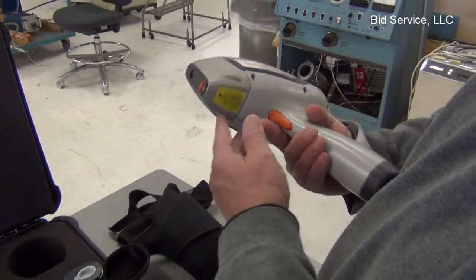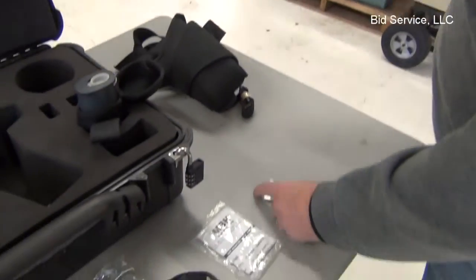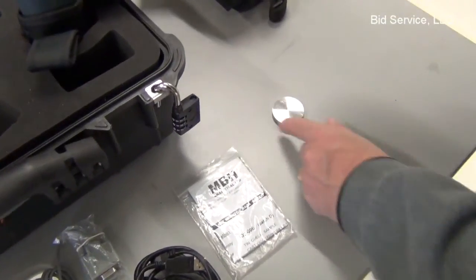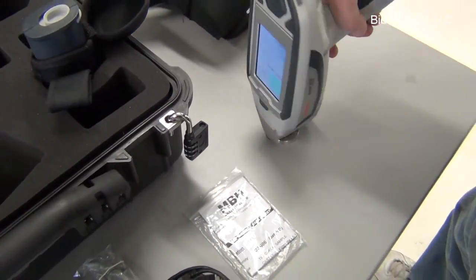The front of the gun is where it takes the reading from. I have a disc here. We're going to take a 20-second reading on the disc and then I'll show you the results.